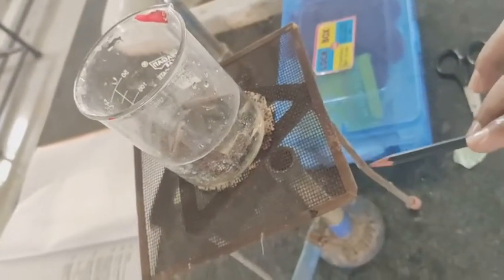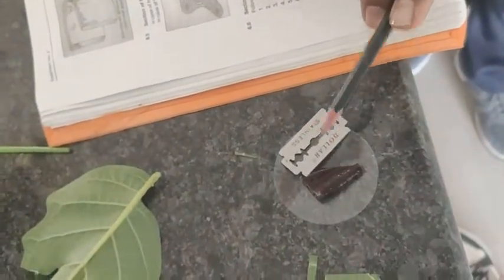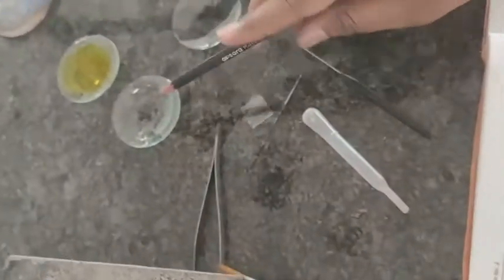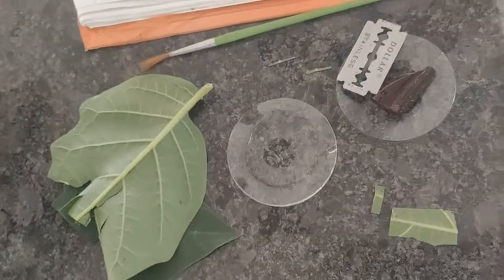First is boiling, then cutting, and then transfer into the watch glass containing water with the help of a brush. This is the first step, preparation of the sample.